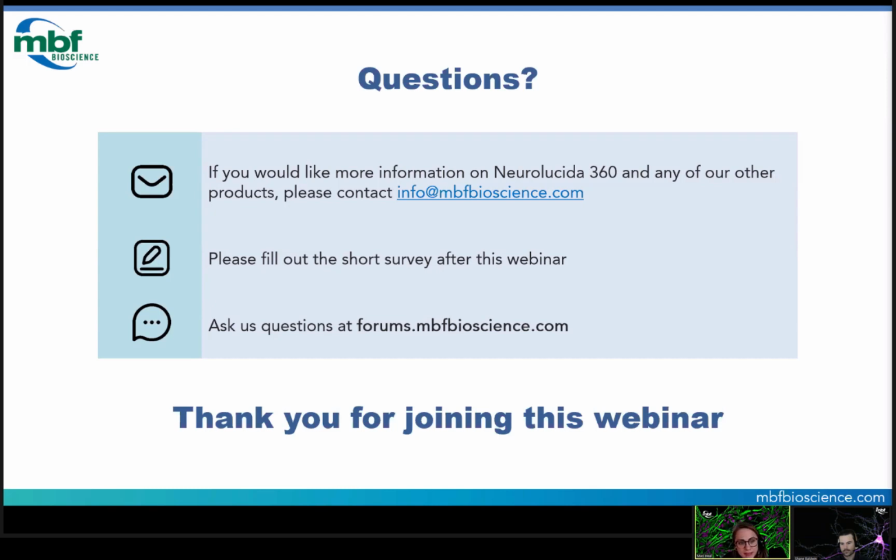And how you do that is you would open one image that you want to test those settings on for your Golgi filter, and copy that image within the queue of the batch pipeline like you had for your different images, Shane.